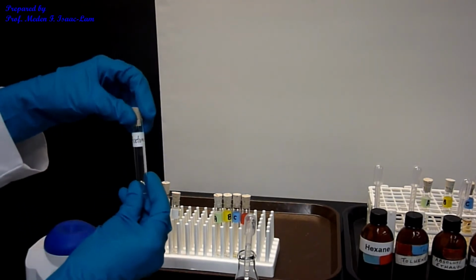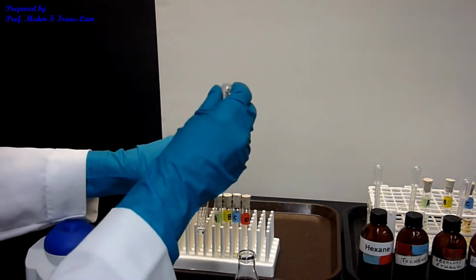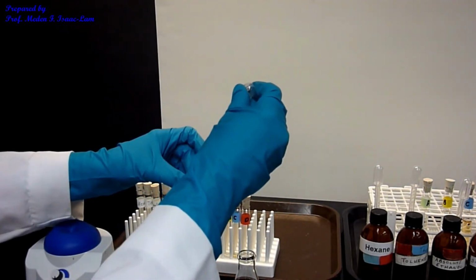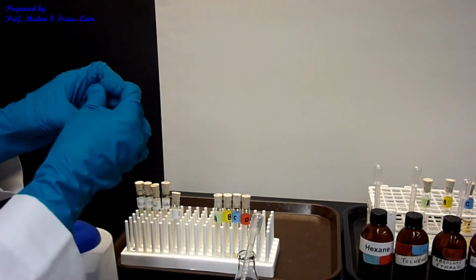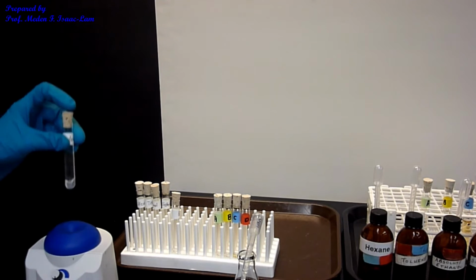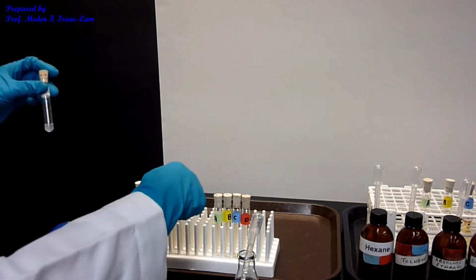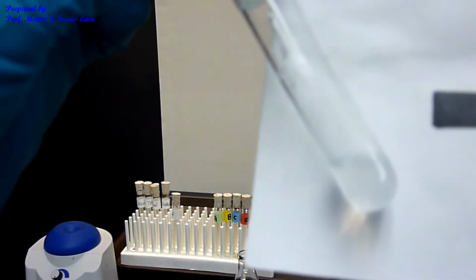So acetone sample, and again, 10 drops. I will vortex, mix it up, and now acetone here. Do you see a layer or no?